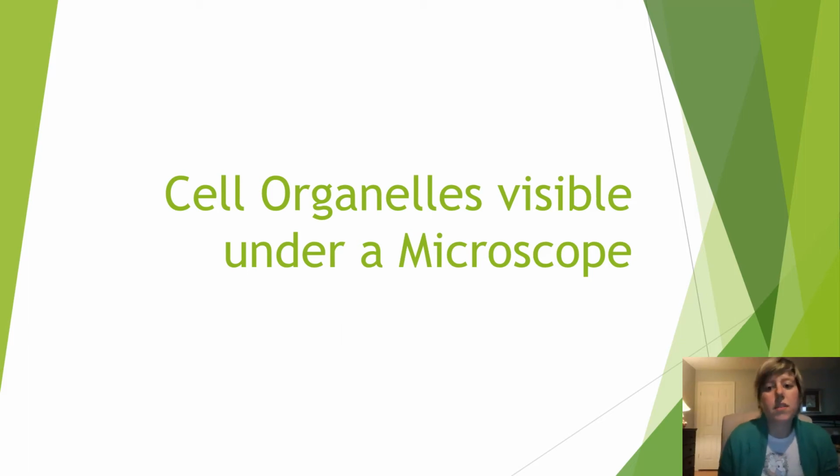Everyone! So in this video, we're going to be talking about the cell organelles that are visible underneath a light microscope. Now, I would highly suggest before you watch this video, you watch the video on the structure of the cell, and particularly the structure of the animal cell and plant cells, because we're not going to really recap all of the functions of the organelles in this video. We're just going to be talking about the organelles that you can actually see underneath a microscope.